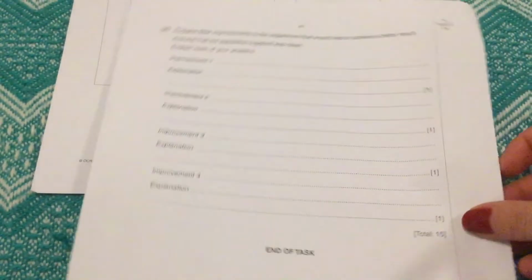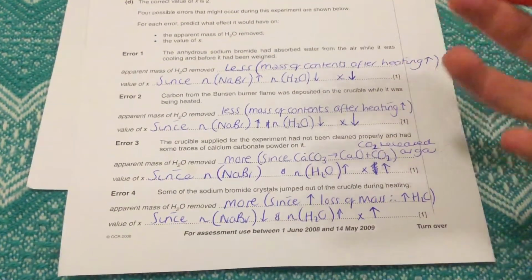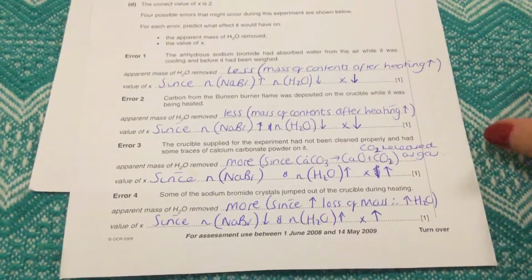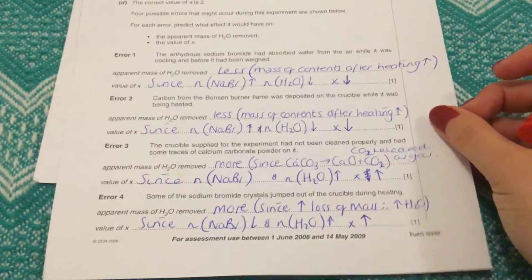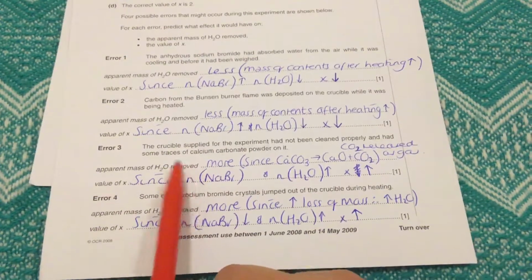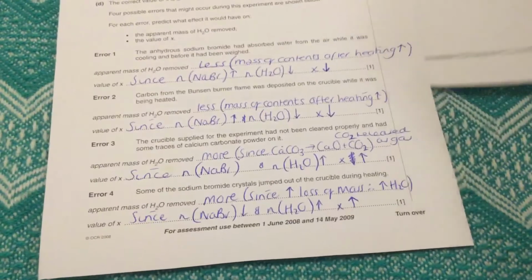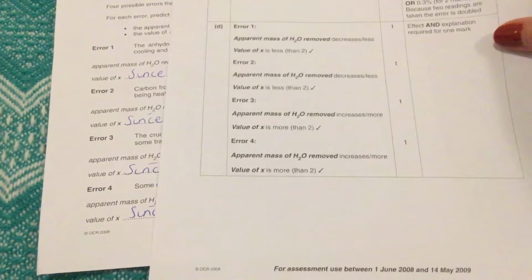The last question is suggesting improvements. Now if we look at this, these are our errors. So use this as your starting point. If these are the errors, what could the improvements be? Now the thing that you have to notice here is it says assume that the apparatus supplied was clean. So that means that realistically this error here we can't discuss because the solution to that, the improvement to that, would be to clean the apparatus. Now the answers for this one are just here.